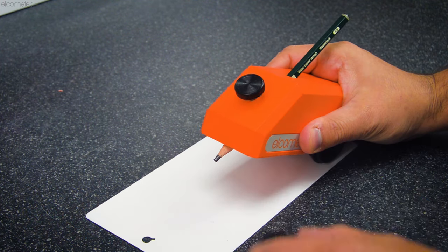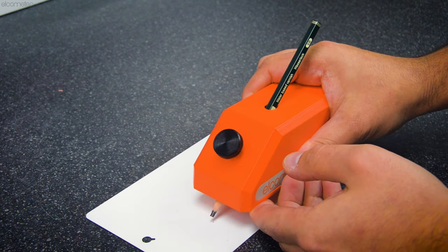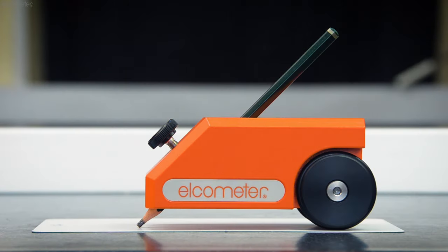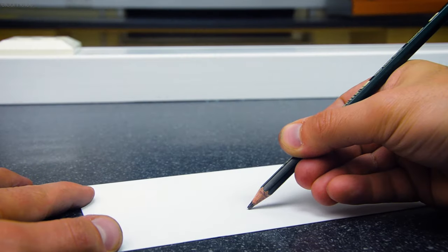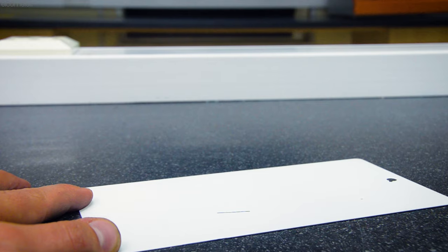One of the most common methods of determining coating hardness is the Pencil Hardness Test, also known as the Wolf-Wilborn method, where a pencil of a known hardness is pushed across the coating at a specified angle under a constant force.